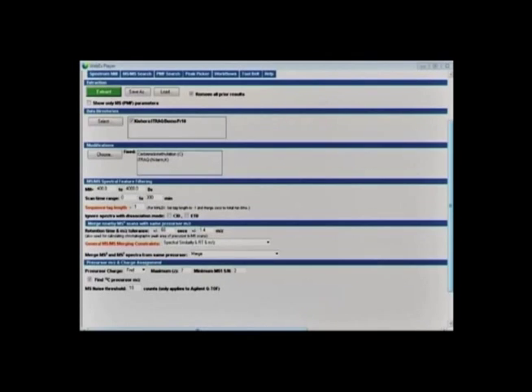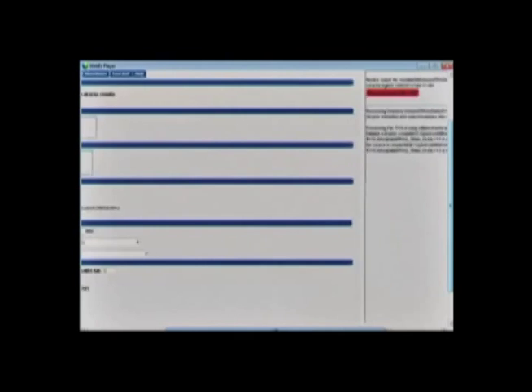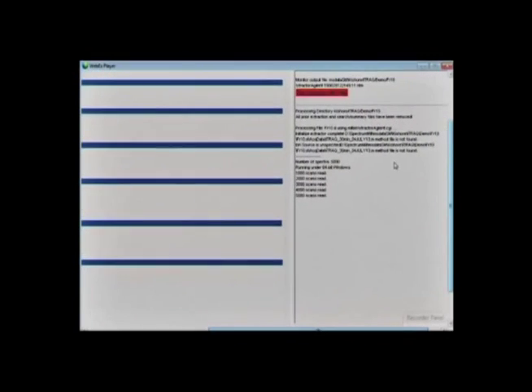The extraction of MS/MS files can be monitored in real time on the right side, and once the extraction is done, we can proceed to the MS/MS search.